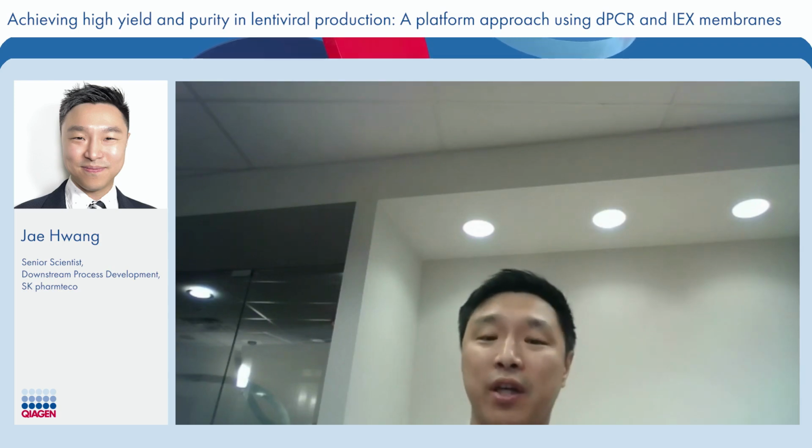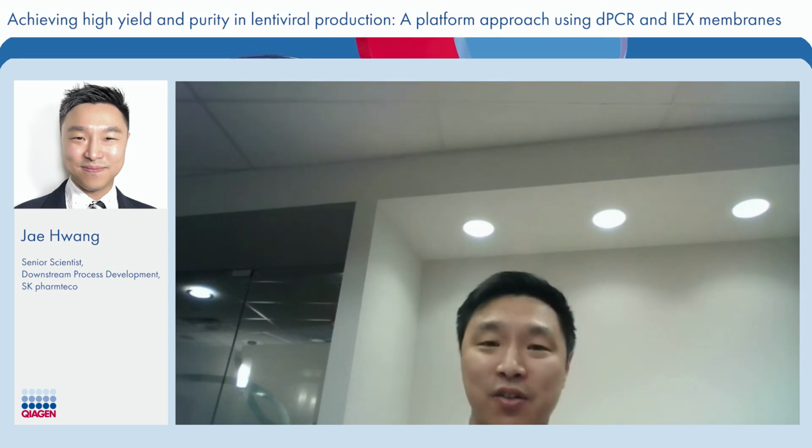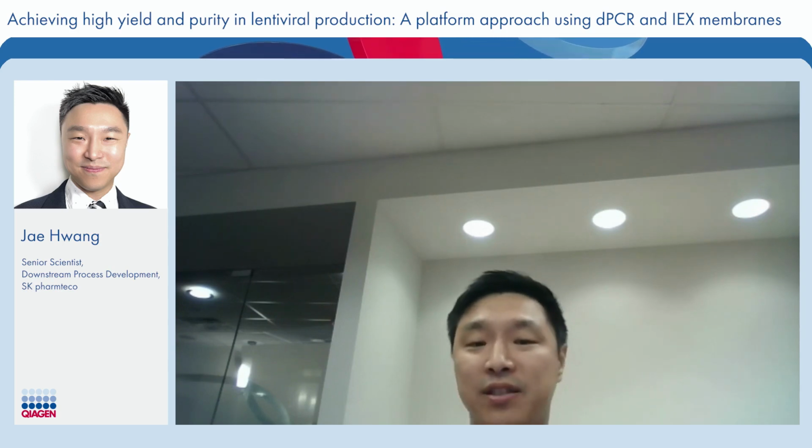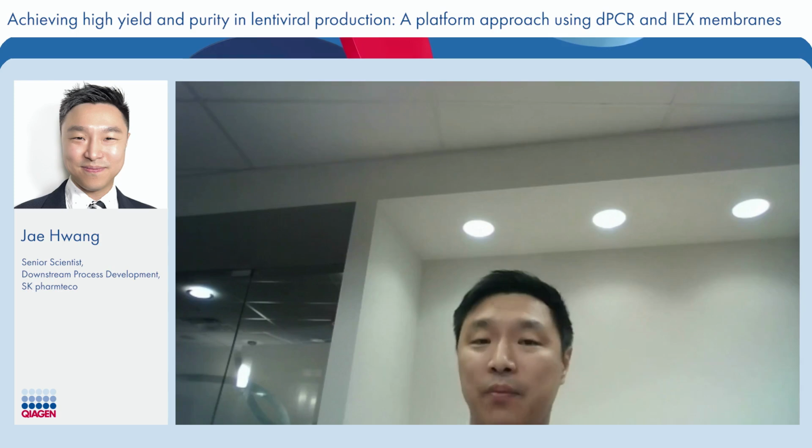So that would also increase the available binding site for the lentivirus. And this also allows us to potentially eliminate the low salt wash entirely and go straight to the elution, leading to about twofold or higher increase in yield while still maintaining high purity.